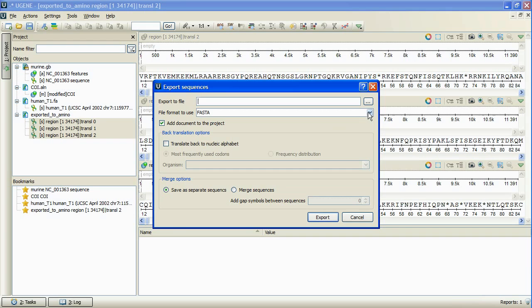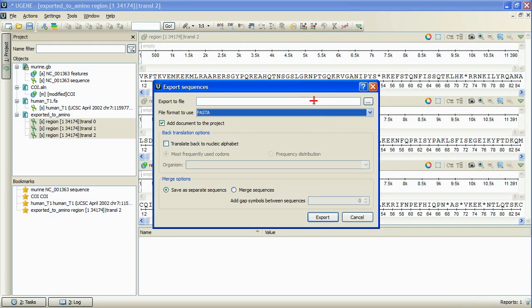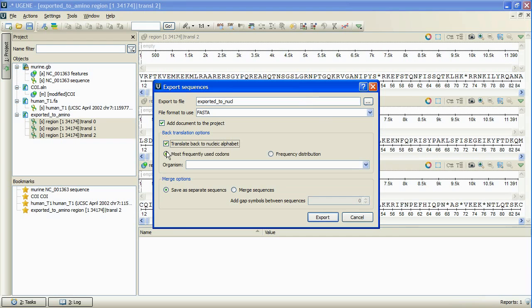Again, we can choose a format to export the sequences into. If we check the translate back to nucleotide alphabet option here, the new options become available.